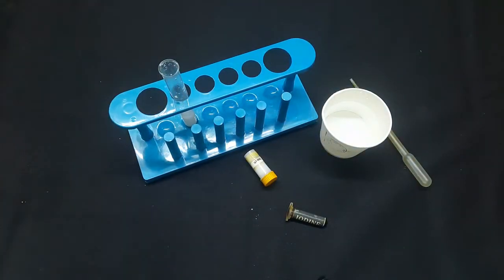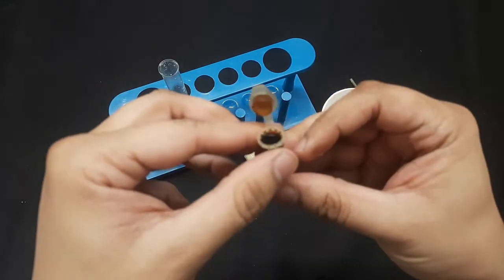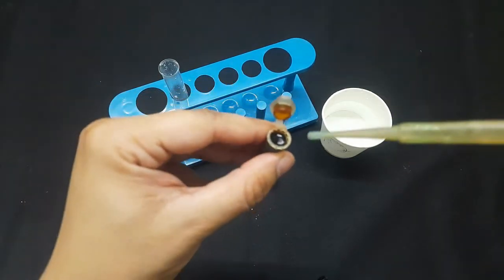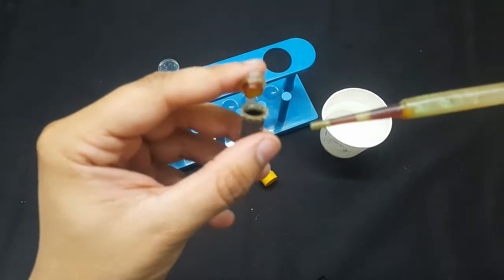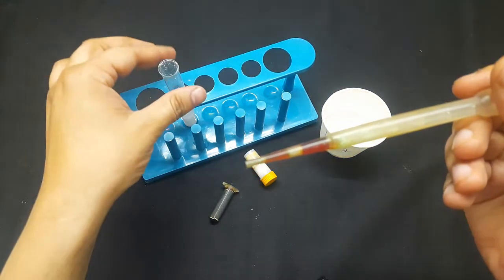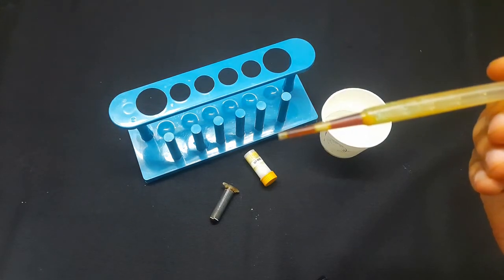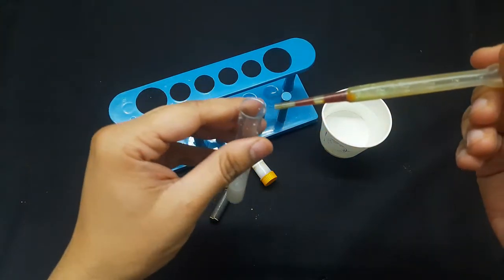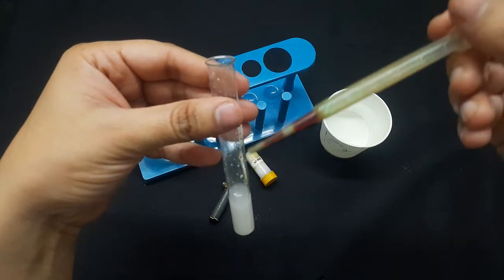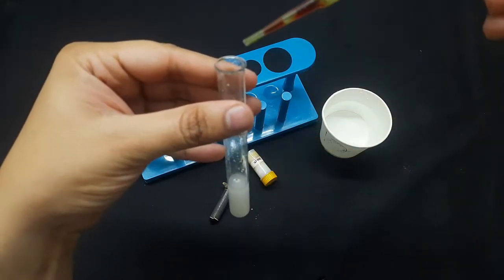And now the next step is that let me take a few drops of iodine. You have to open it very carefully and take 1 or 2 drops of iodine in this dropper. Now the next step is that you have to put these 2 drops of iodine in the test tube. And here you can see if the color changes to deep blue or black, it shows the presence of starch inside this test tube.